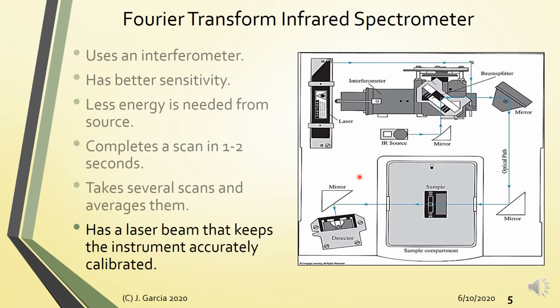For any optical instrument, it is important that you are able to keep the alignment of all your optical components. That is why an important thing when you are installing your optical instrument, whether that is UV-Vis, AES, or IR, is that it should be in a stable place, away from any source of vibration, because this can misalign the optical components inside your spectrometers.